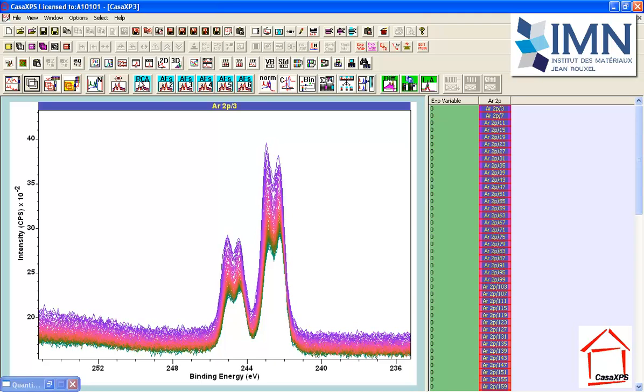Let's do a PCA. The PCA is going to transform the spectra that we see here into mathematical forms. These mathematical forms will be related to the data in the sense that the first one has a relationship to the average spectrum, and then the second form that I will create by PCA will tell me how all the other data deviate from the average.